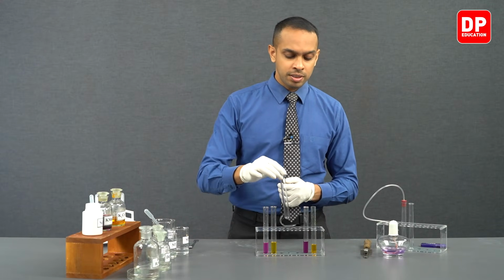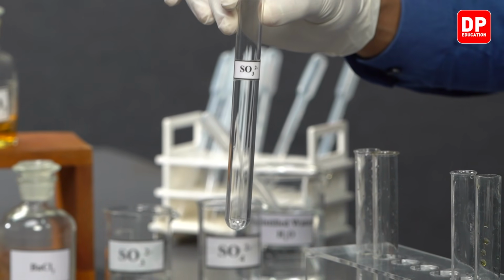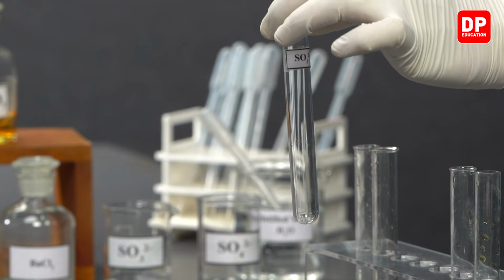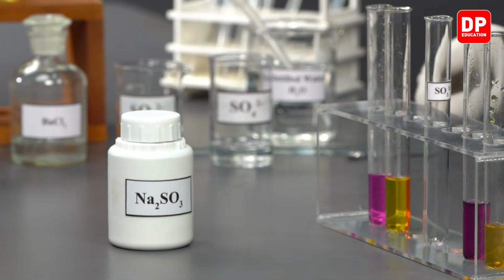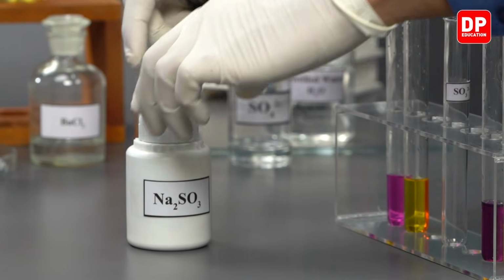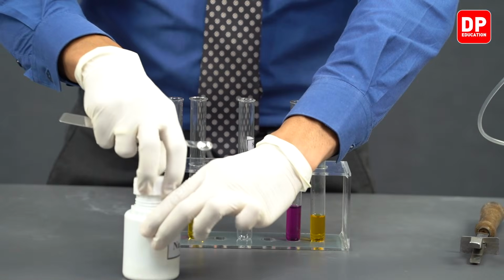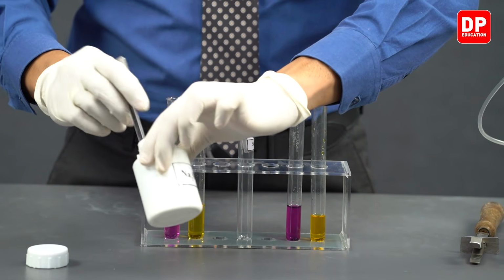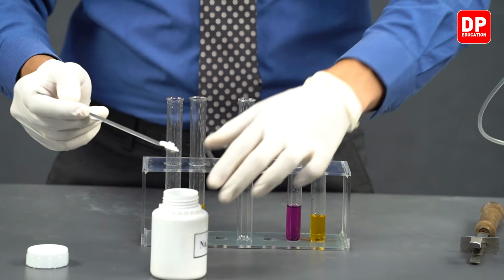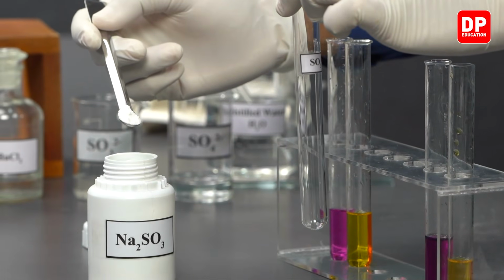So we have this test tube that we spoke of earlier. To this, we will be taking a small solid sample of sodium sulfite. You can see it's a white color solid.